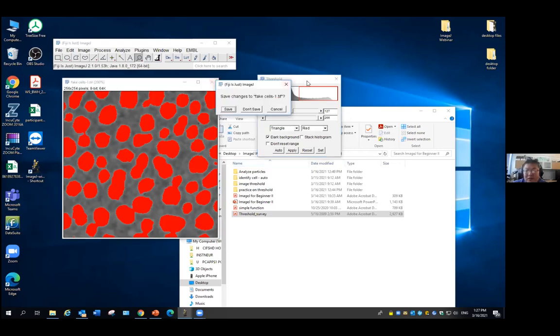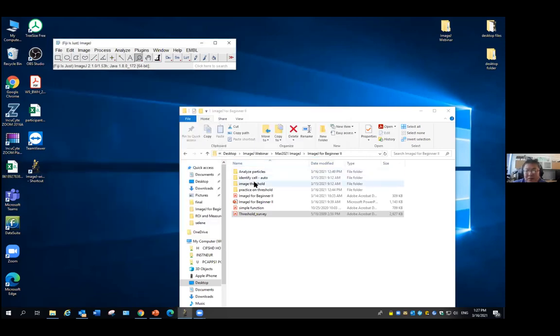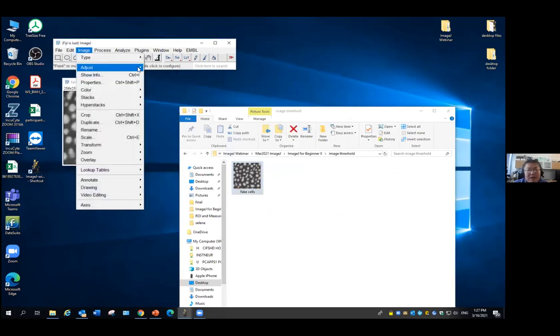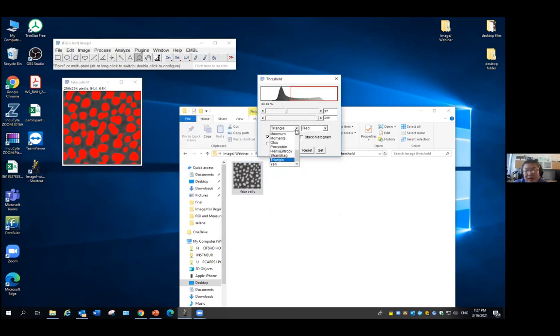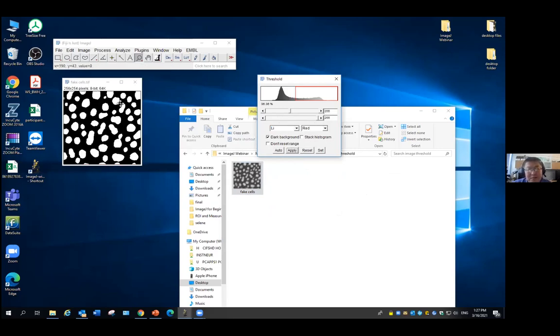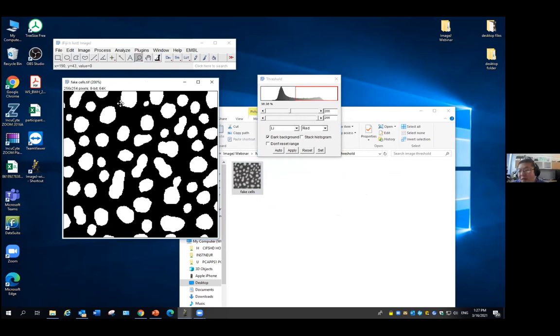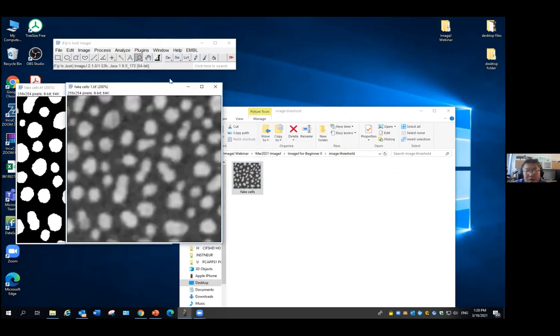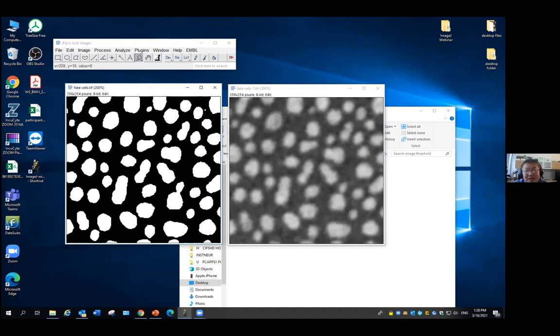So let's say for this one, let's go back to the image. I use the thresholding, I would say I use Li, 115. I apply it. So this is a mask. Why will this help us to identify the cells? Before, when looking at the cells, I drew them one by one. But now I think it's much easier.